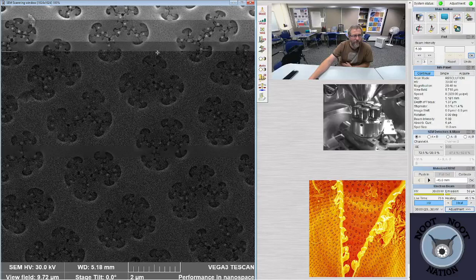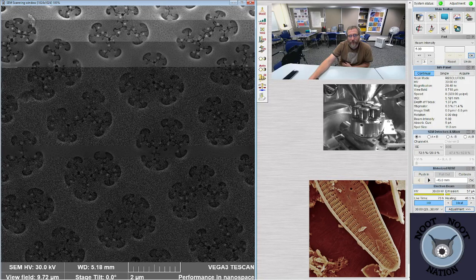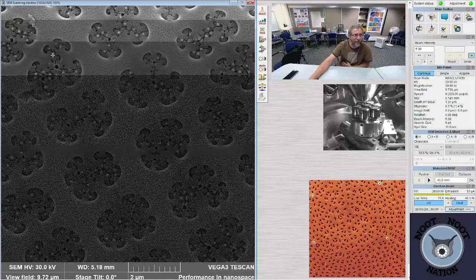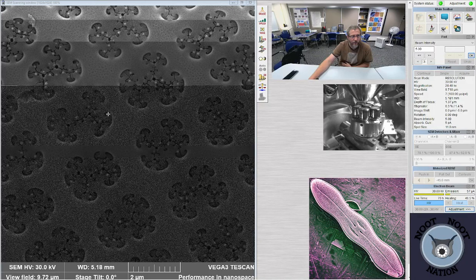So that's speed 7 with beam intensity 7, speed 7 with beam intensity 6, and that's speed 8 with beam intensity 5. You can see how the image quality improves each step of those as I did that, and even though it's kind of a long wait, I'm just going to go ahead and collect this at a long beam intensity, because I really love how this structure is. That's just amazing to me in there, the intricate nature of those pores is just absolutely spectacular. Okay, and maybe I'll fix the brightness contrast again so it doesn't look quite so dark.